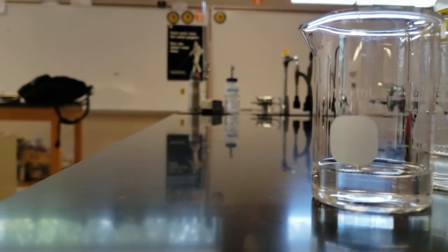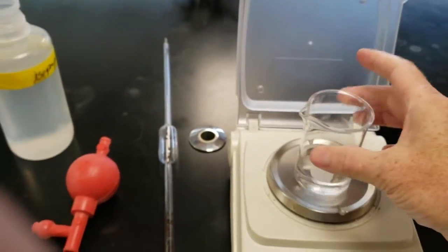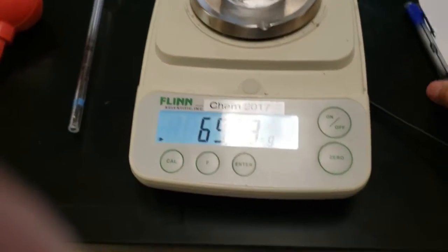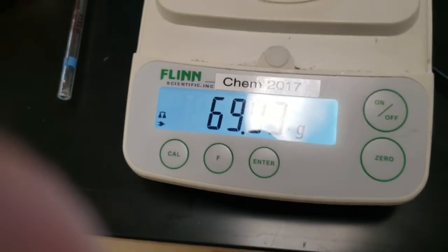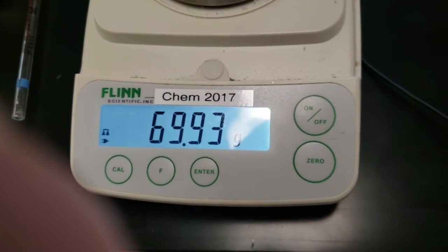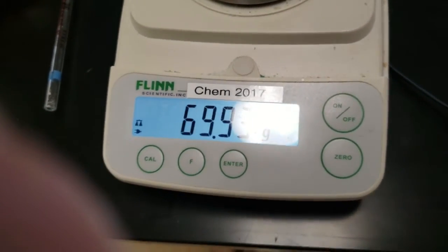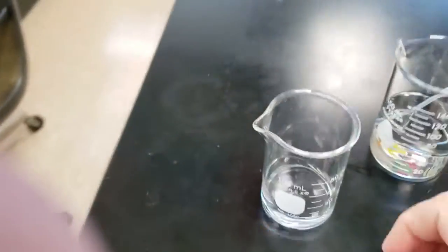Once you think you have it so that the bottom of the meniscus is on the line, we are going to zero out the scale and weigh it again. So this would be the mass of the beaker and the 20-milliliter alcohol. For this lab, we're using isopropyl alcohol. Some other lab, we may use ethanol or methanol.